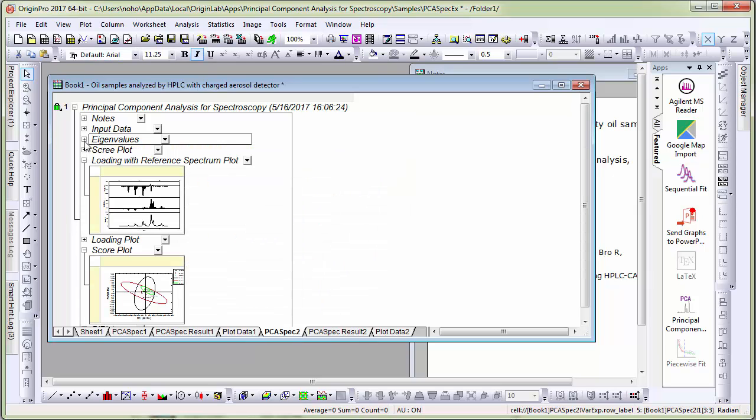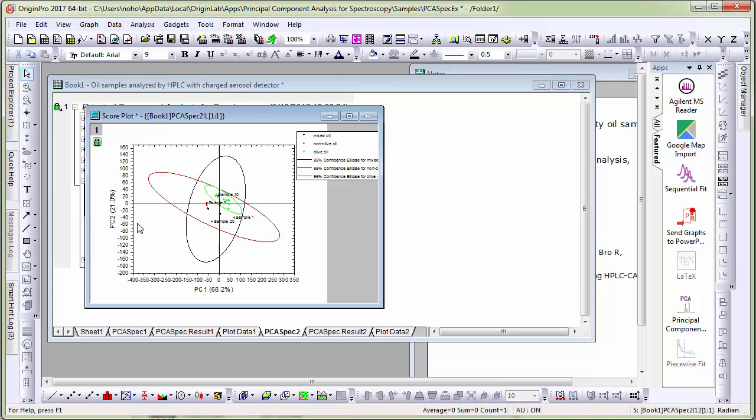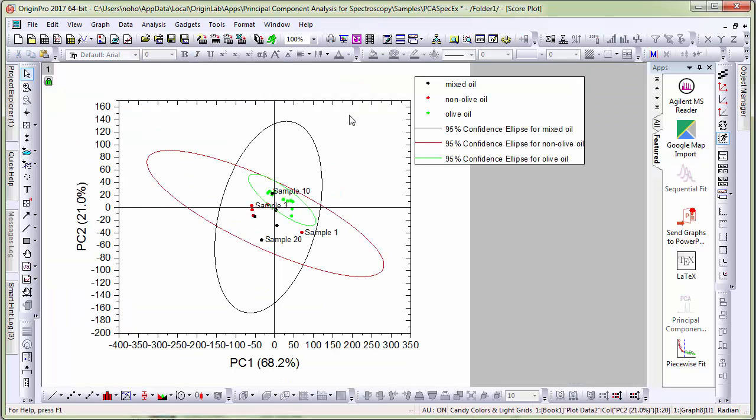Let's collapse this table and let's first look at the score plot. Let me double click to open the score plot and maximize it.